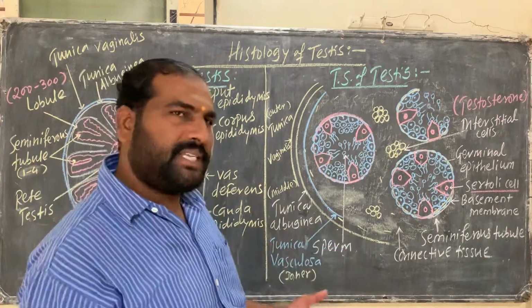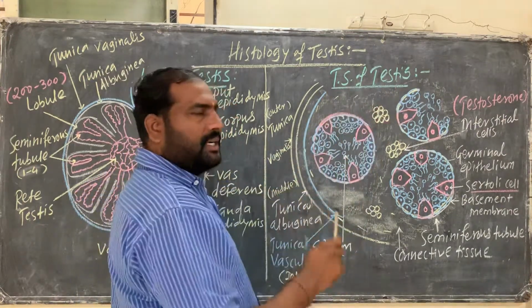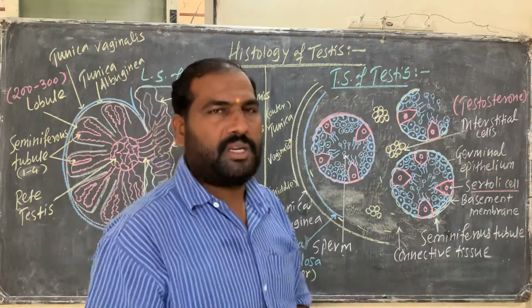In that, what is that? It is actually the TS of testes. TS means transverse section.